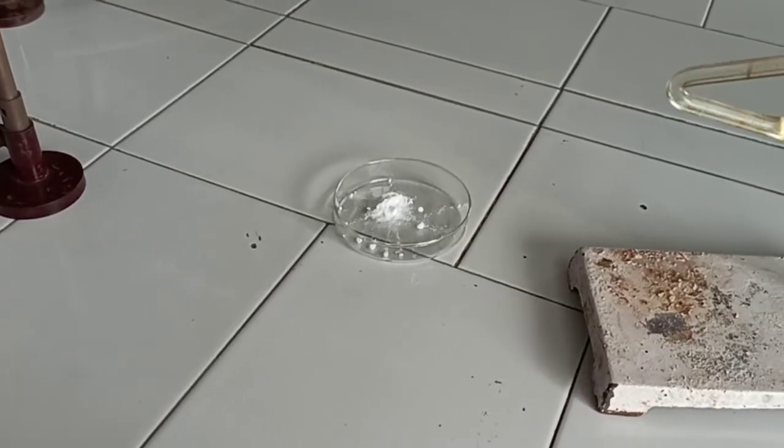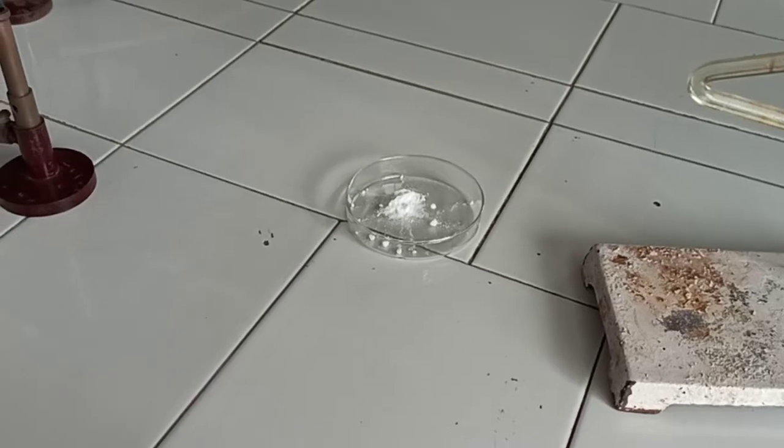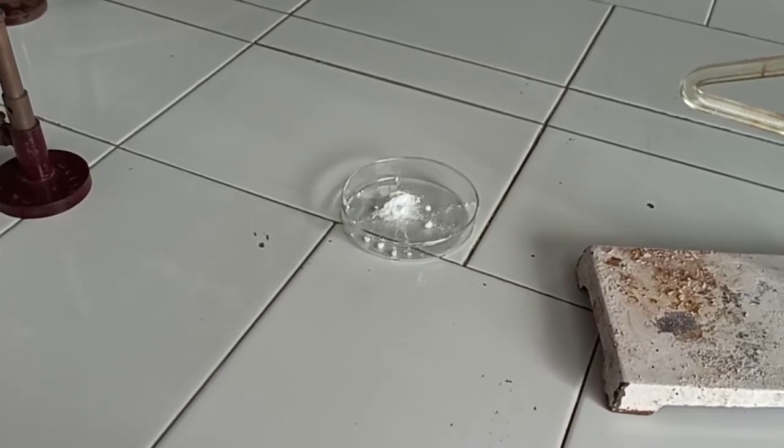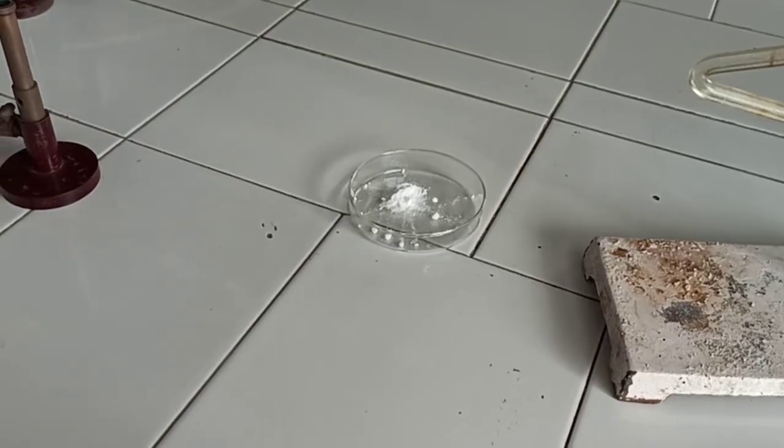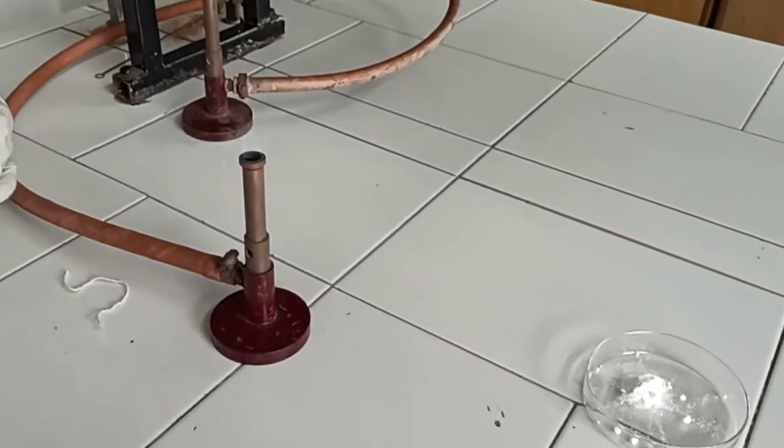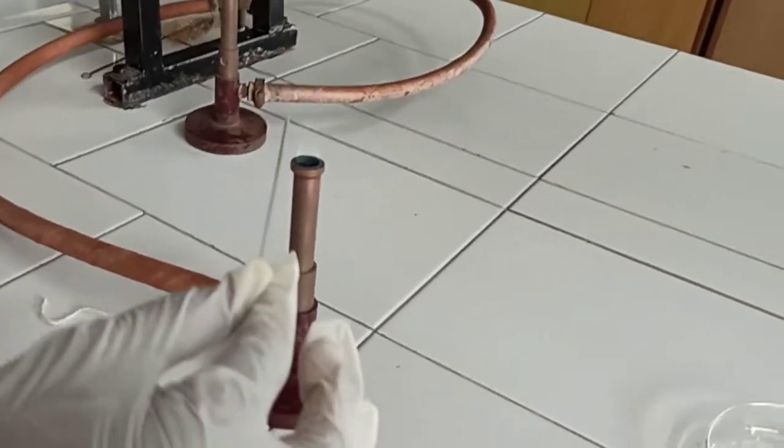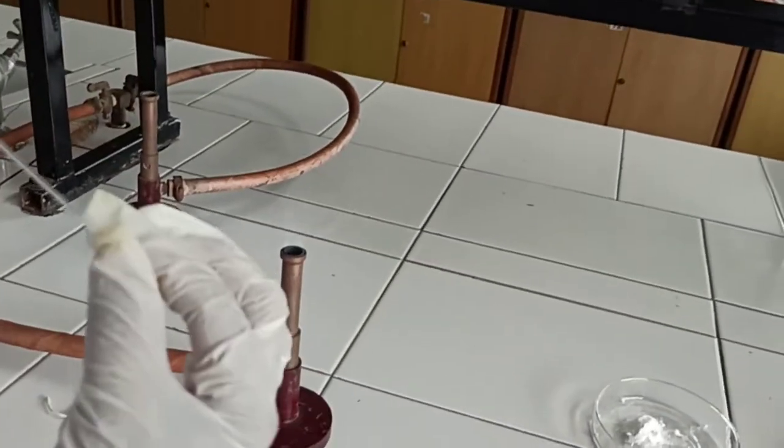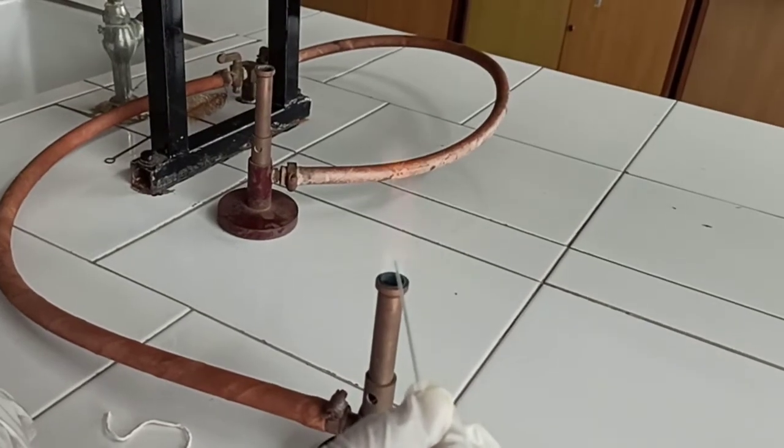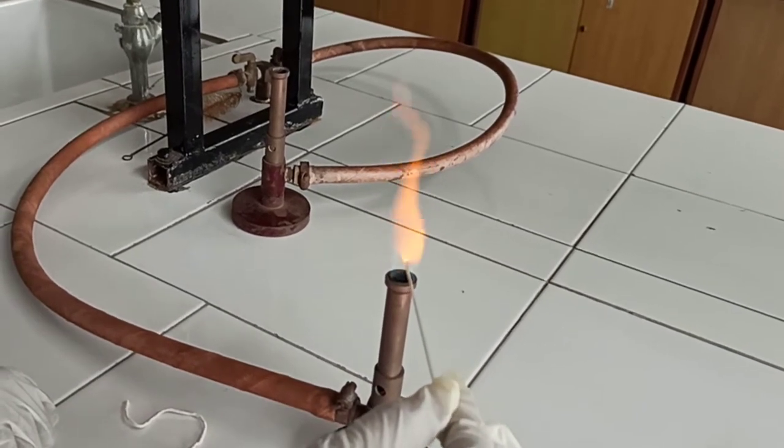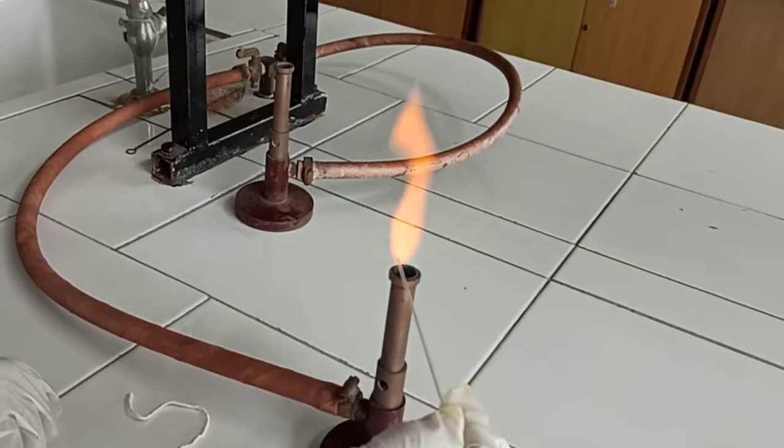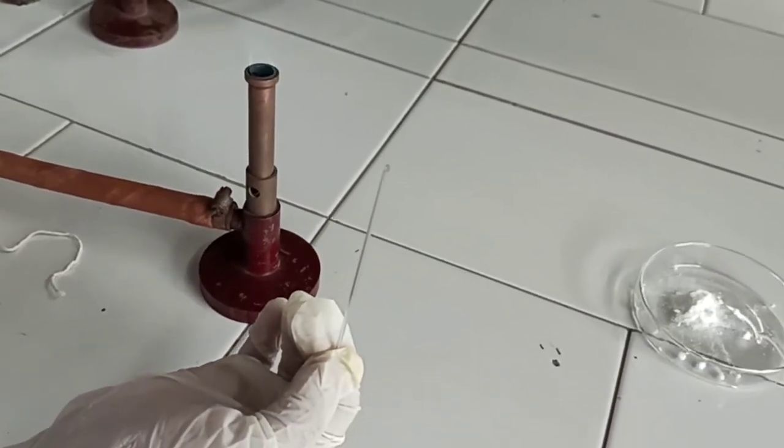See the stepwise procedure. The first step is that you have to take a capillary and seal its one end by holding it in flame for a while. See the procedure. We have to rotate that capillary tube in the blue flame so it gets sealed at one end. See, it is sealed properly.